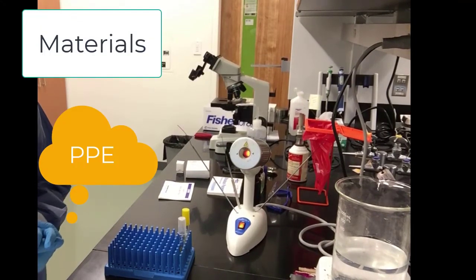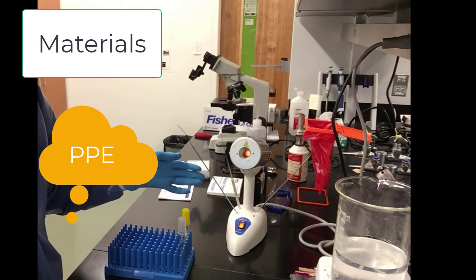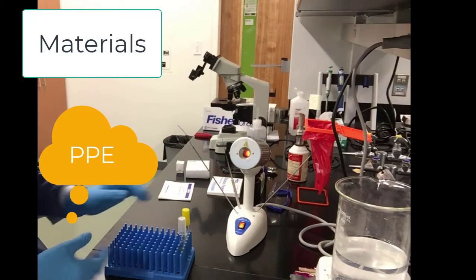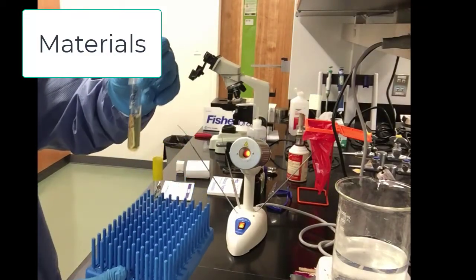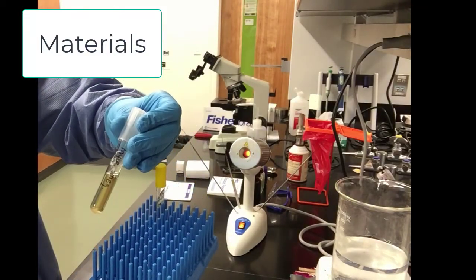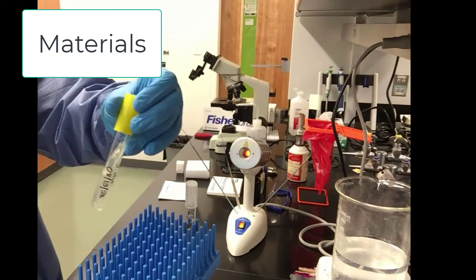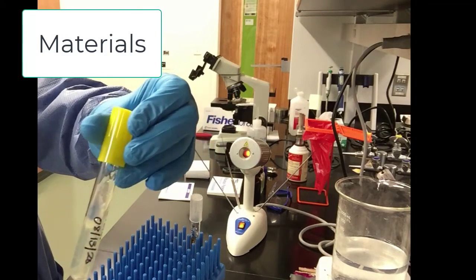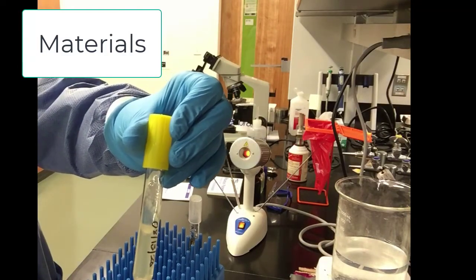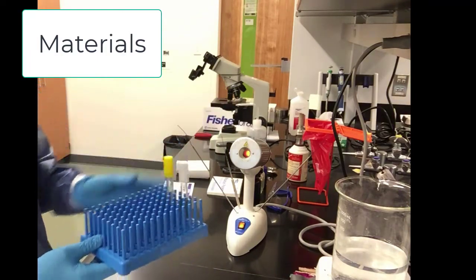We will move on to the materials. First, of course, the PPE, the bacticinerator. We will be using two bacteria. We have a Mycobacterium smegmatis in liquid broth, and we have a Staph aureus. I don't know if you can see this up close. There's some slimy bacterial culture on the agar slant. So Staph aureus will be on an agar slant for us.